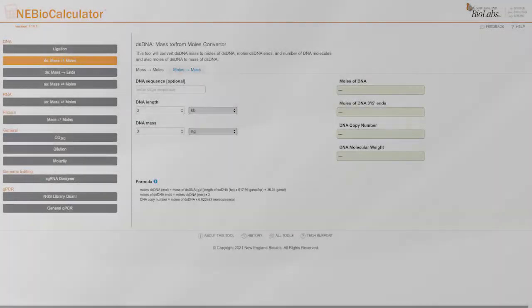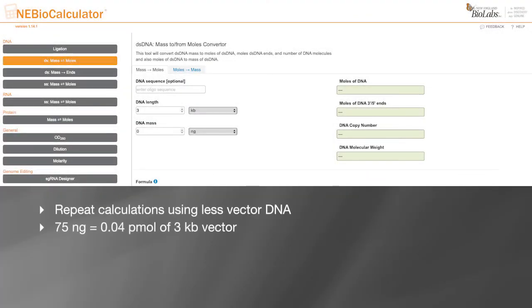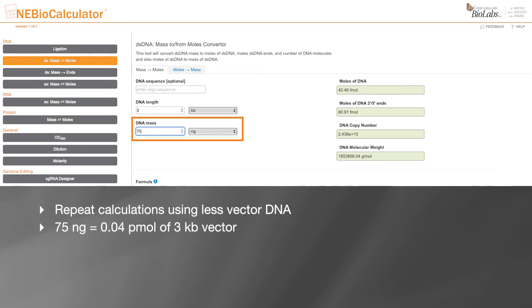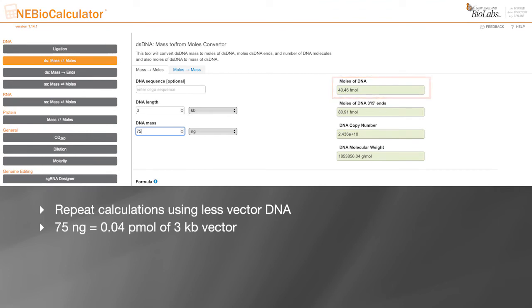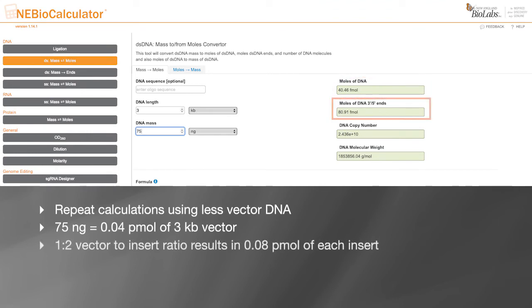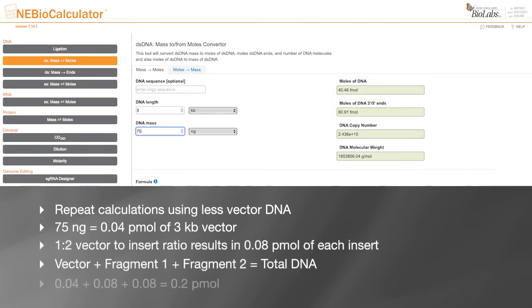If we repeat our calculations with less vector DNA, for example 75 nanograms, we find that we have 0.04 picomoles of vector and 0.08 picomoles of our two fragments for a total DNA input of 0.2 picomoles, which is within the recommendations.